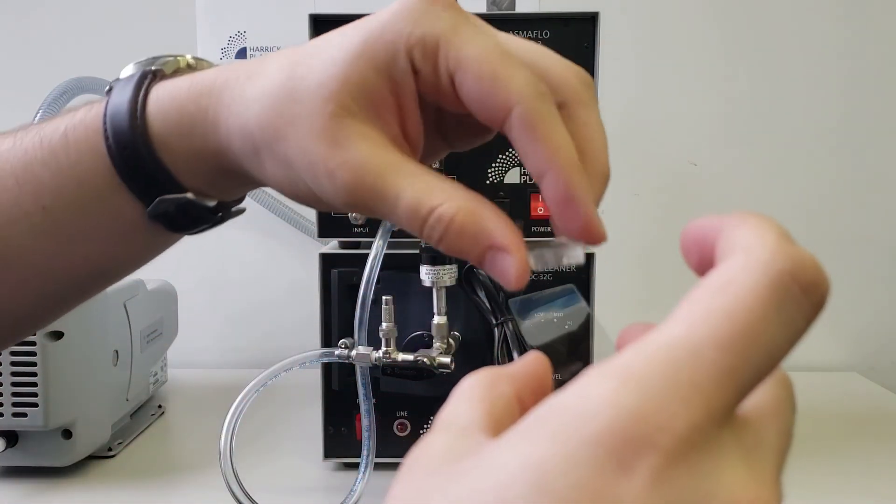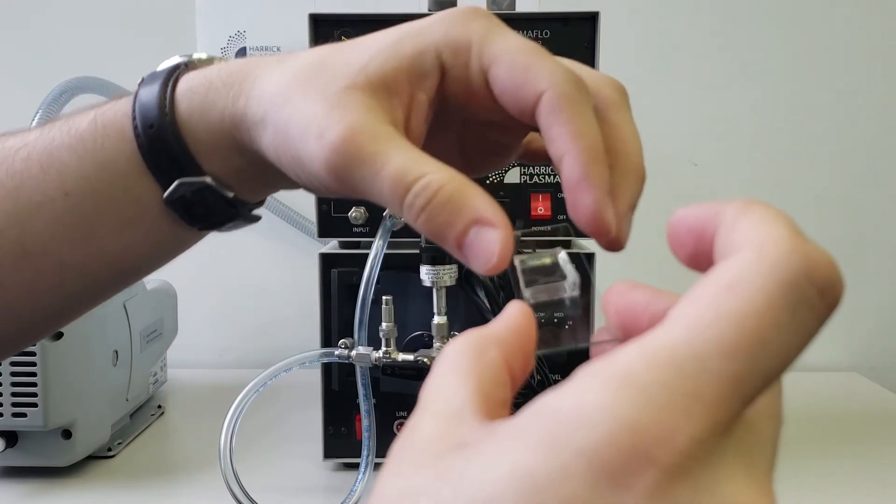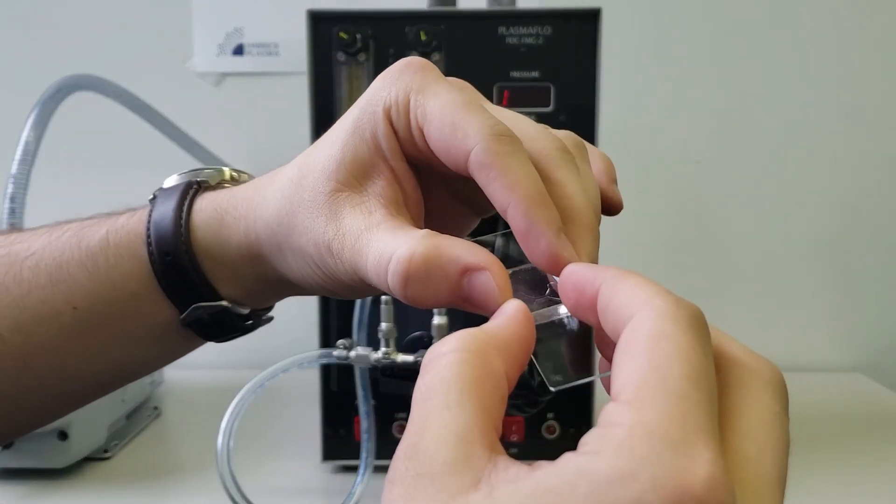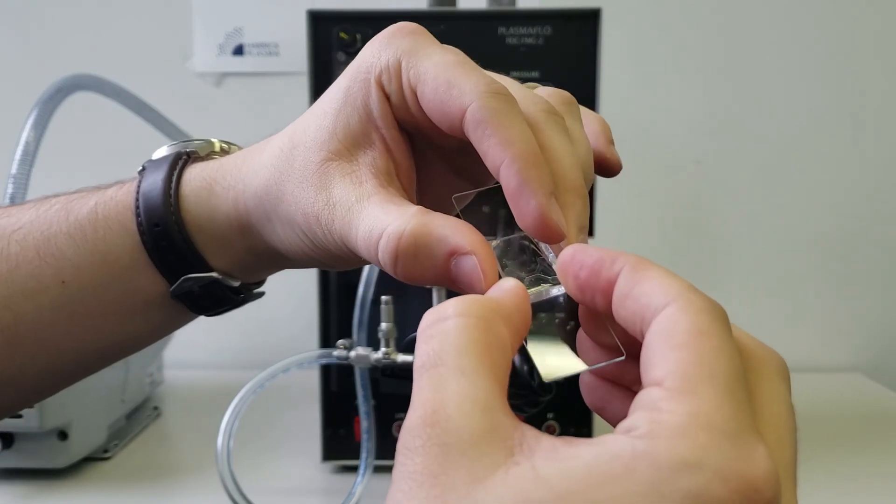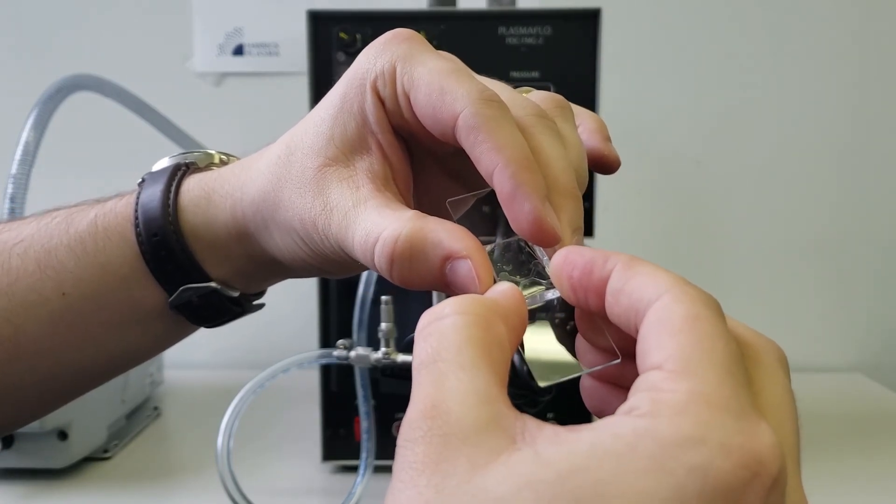Immediately following plasma treatment, press and hold the PDMS and glass components together for 30 seconds. Be careful not to pull the components apart to adjust the alignment, as this will disrupt bond formation.